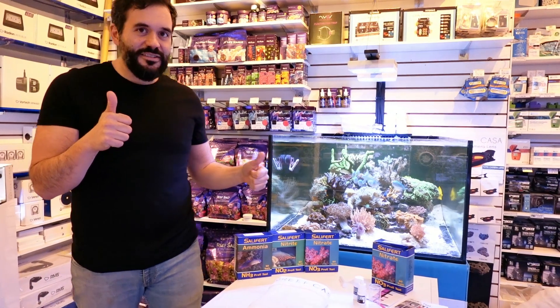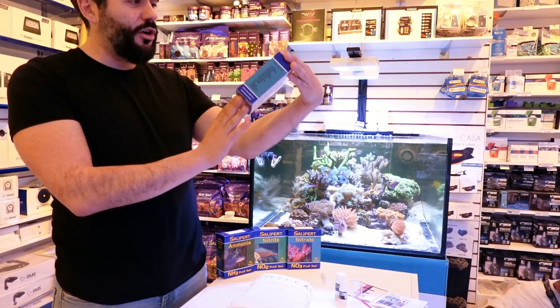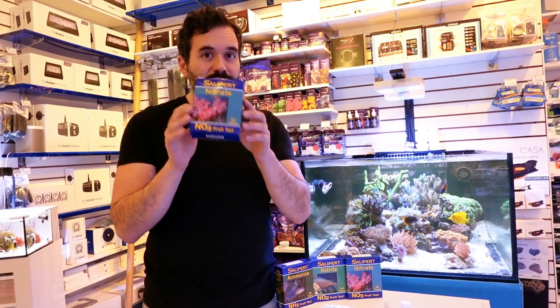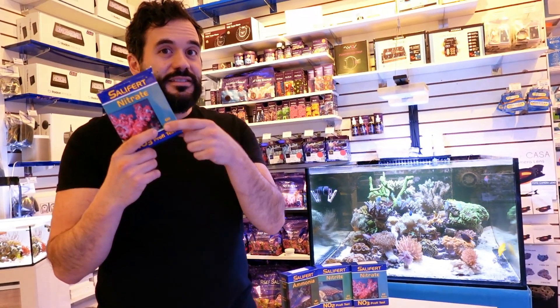We have Kavina as the camera woman today. We're going to use this test kit here — Salifert, out of Holland, I believe. Made in Holland. They've been making these for a very, very long time. Super easy to use, inexpensive. I think they're like 20 bucks Canadian and you get 60 tests.